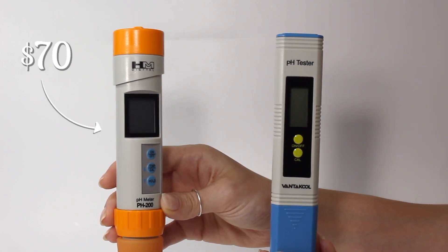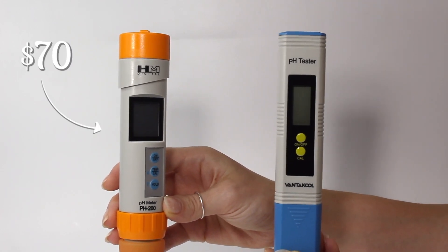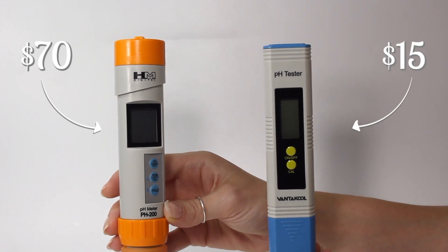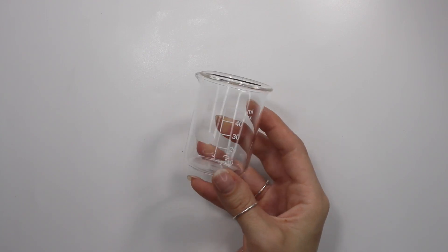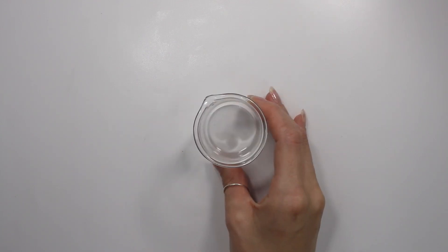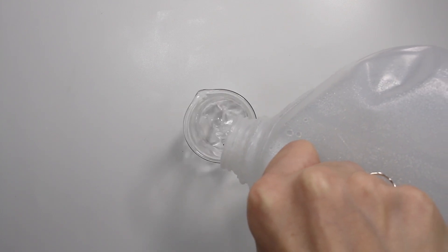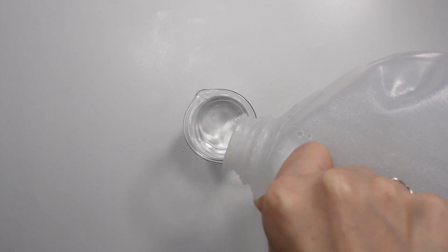So like I said, I am comparing this $70 pH meter to this $15 pH meter. Both of these can be purchased on Amazon. Also in this video, I'm going to be showing you guys how I take the pH of thicker solutions, such as like creams, serums, and face washes if they're like thicker face washes.